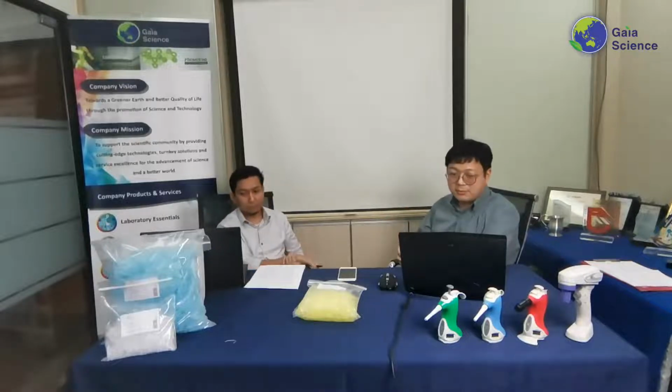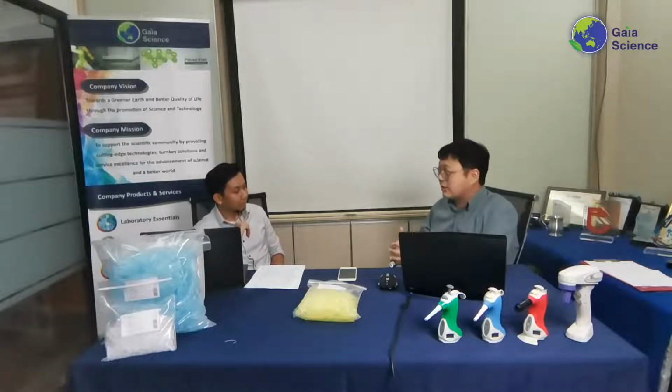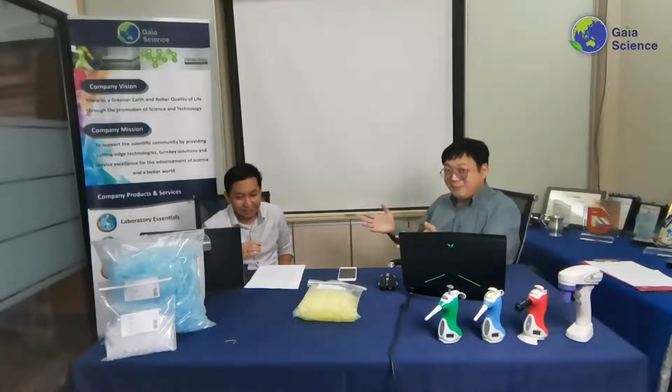The filter tips are actually good not just for aerosol situations, but also help for forensics and diagnostics, by the way. It will also help if you're working with DNA or RNA solutions, and with infection samples as well. Also, if you have radiolabeled samples, it's good to use filter tips. You don't want the radioactive stuff flying all over the place, right? I see. You don't want us to be Incredible Hulks after that, right? Well, who knows, right? So yeah.